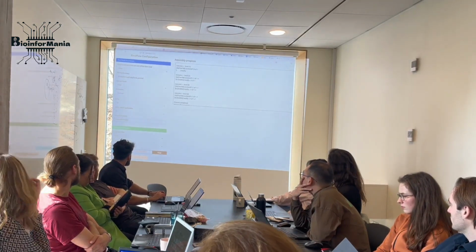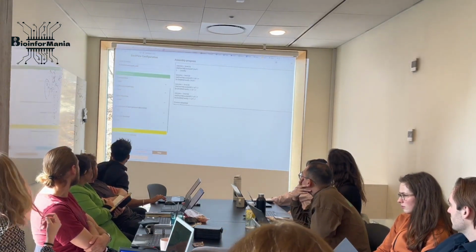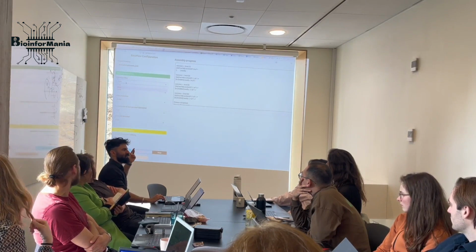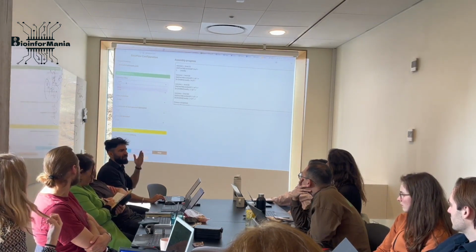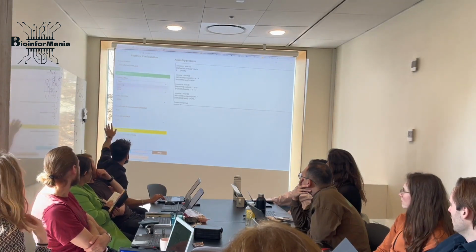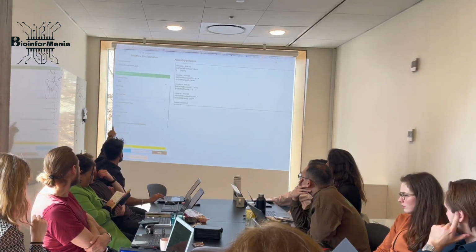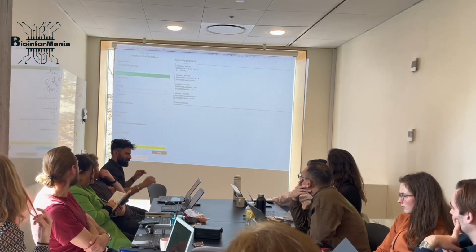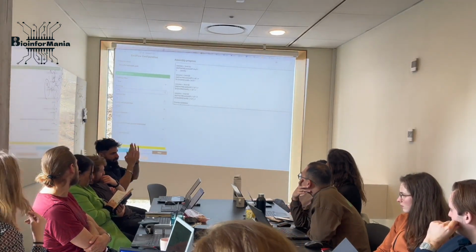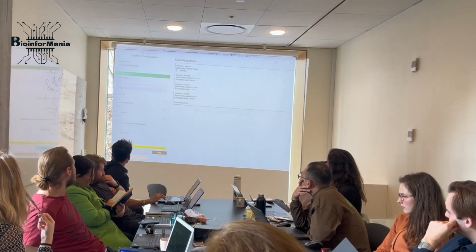Let's say sm junk, okay? Inside my home directory. And then coverage filtering. You remember I said you can filter the coverage. The reads that we have were about 1.3 gigabytes maximum. It's not going to overwhelm anything, okay? The coverage is reasonable for this genome size, so I want to set it to false. But if you want to do the coverage filtering, you need to know the genome size approximately, and also you need to have a minimum of 40x coverage. And you remember what coverage was, you know? That sandwich of those reads, if you put them together, in each position, that's coverage for them. So that's important. But anyways, I'm going to set it to the default with false.